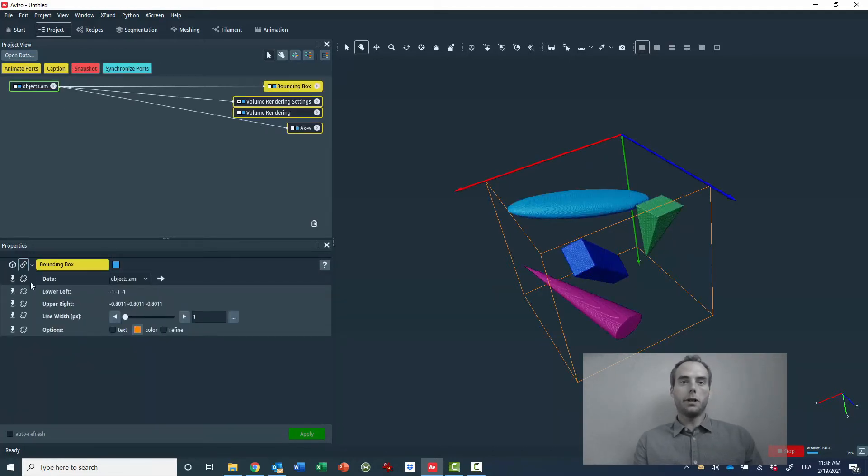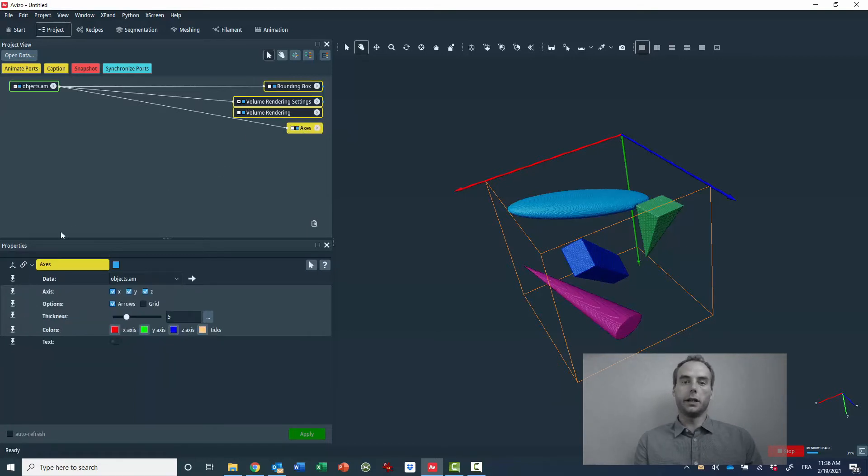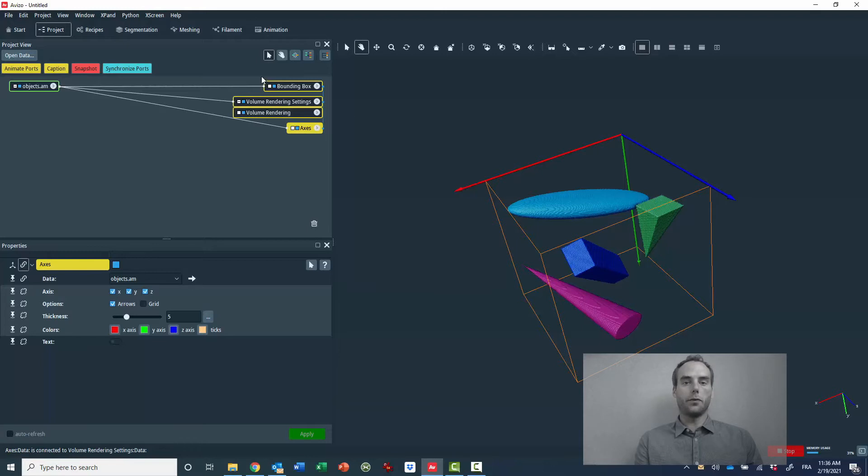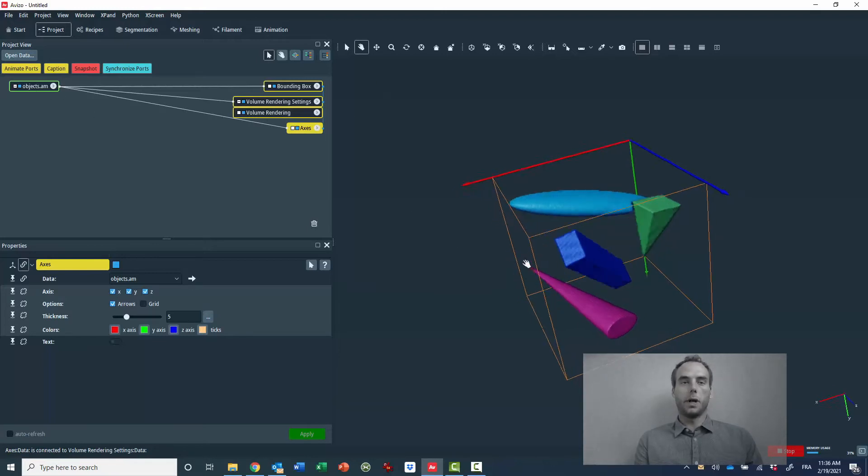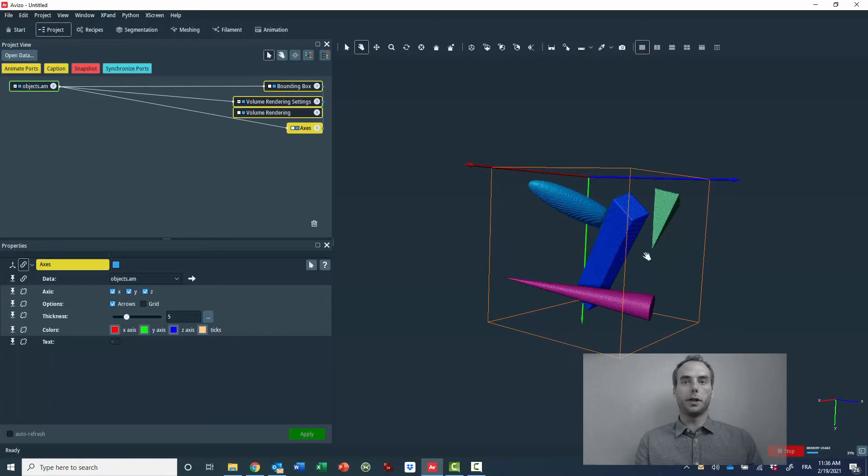For that I will use an example dataset that you can see here. This is a label image composed of four different labels, where each label represents a very typical geometrical shape.